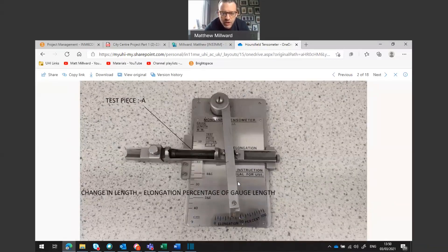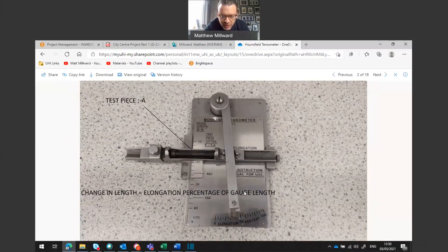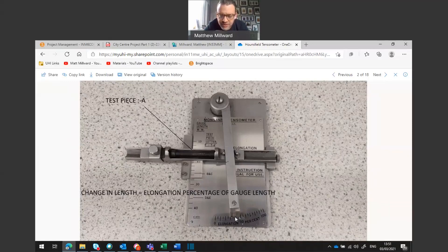We can see test sample A, where the sample has been tested and joined back together and put back into the elongation measuring gauge. The change of length equals the elongation percentage of the gauge length. This works out as a percentage of the total length and as you can see the elongation is approximately 10, 20, 30, just before 40 — so around about 38 percent of the original length it is elongated by.